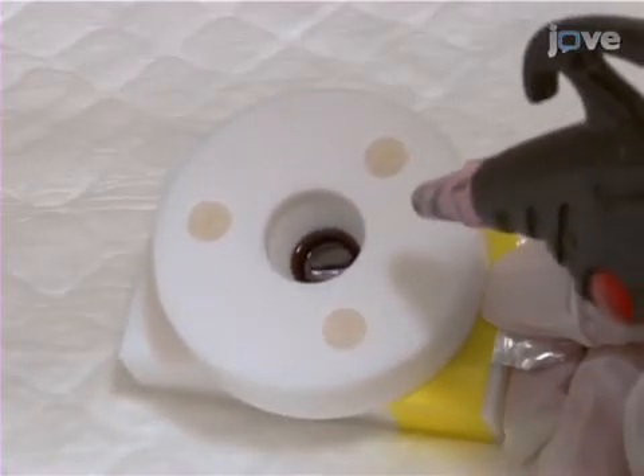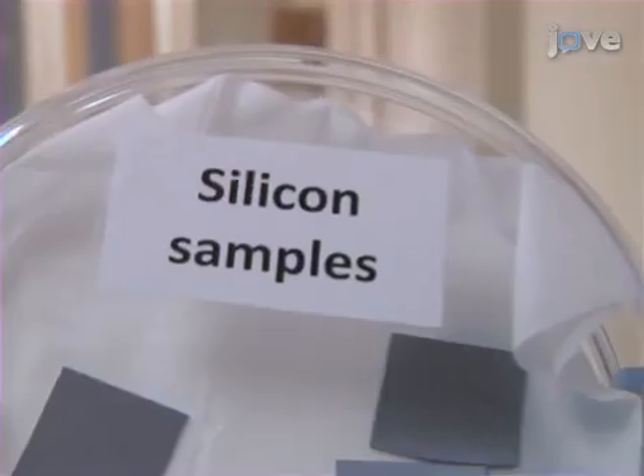Then, dry the films under a dry nitrogen gas. Next, oxidize the freshly etched porous silicon.